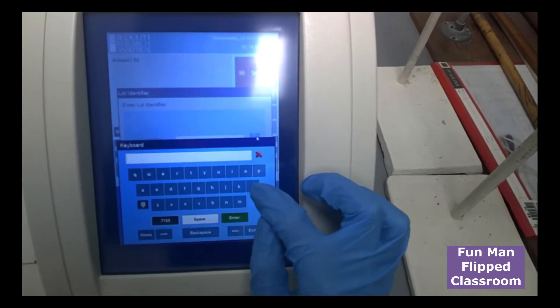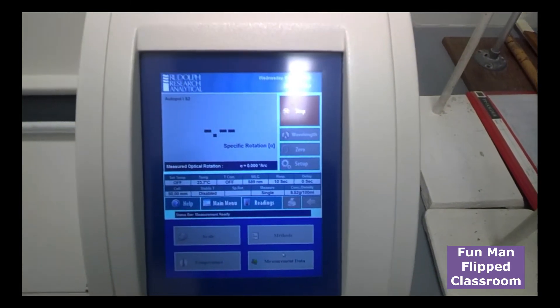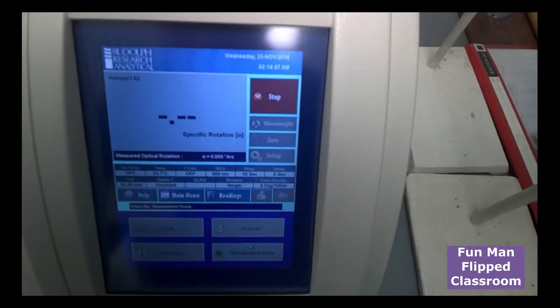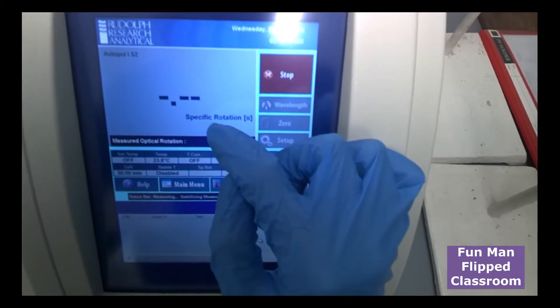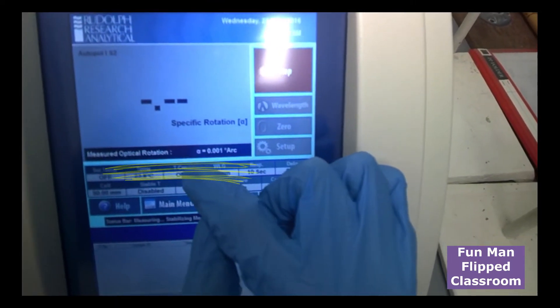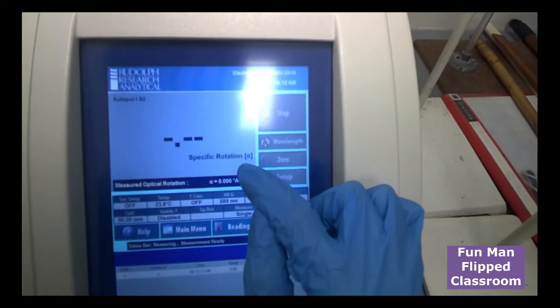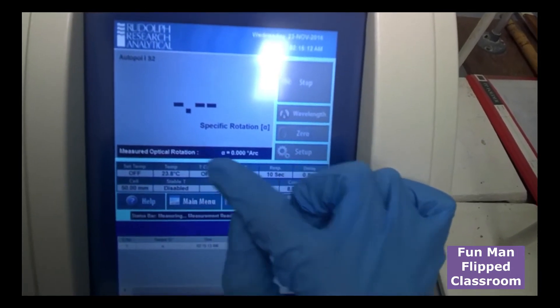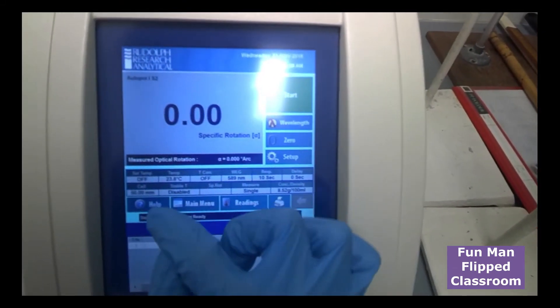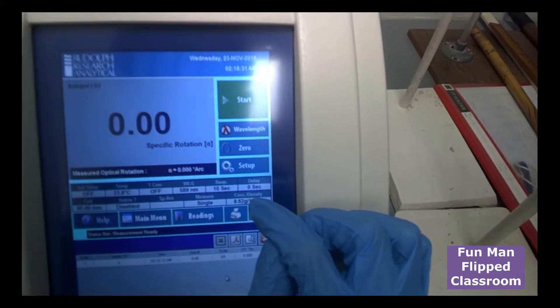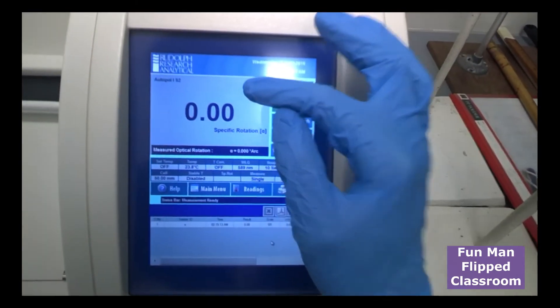For log identifier, we just key in any initial that represents your sample. Enter. Same thing for sample identifier. And you wait for a while. The control panel will say stop later. And you'll see a reading that indicates a specific rotation. Now guys, you know that here they also tell you the measured optical rotation. And how are these related? The specific rotation is linked by a formula. You will divide the measured optical rotation by the cell path length and the concentration. So in this case, we key in the cell path length and the concentration. And the machine here will tell you the specific rotation. And now we are right. It should be zero. There's no chiral center. So very good.